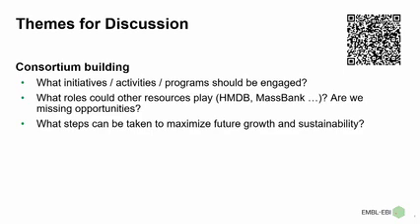I was actually thinking of this yesterday. Rick mentioned that a lot of data on repositories doesn't have QC samples. And we wrestle with that, where maybe we run 100 samples of various types, and when we look at the data, we say the question we're asking is only about these 50 samples, and we've pooled 100 samples, so our QC is made of 100 samples, but we're not doing anything with certain bacteria that are in that data, so we align without the QC samples. Well, we have the QC samples to make sure that the system worked, and that's another issue with how we're representing and reporting our data: to be careful not to bias it.